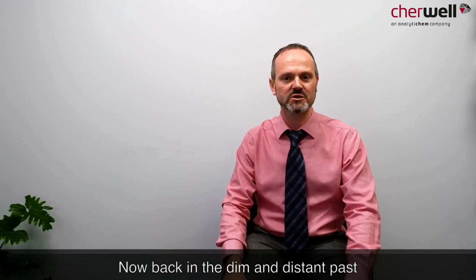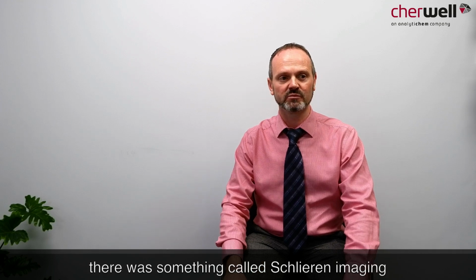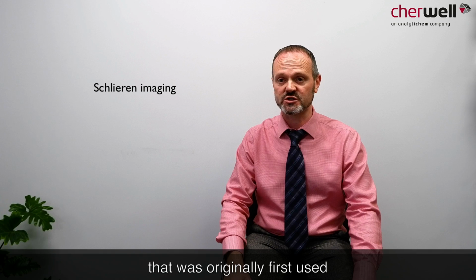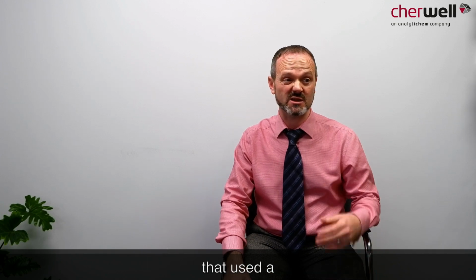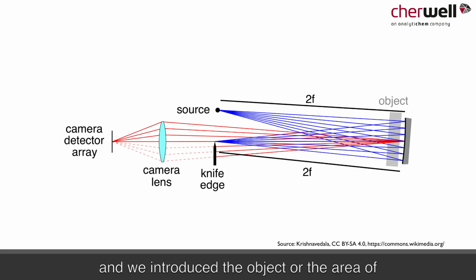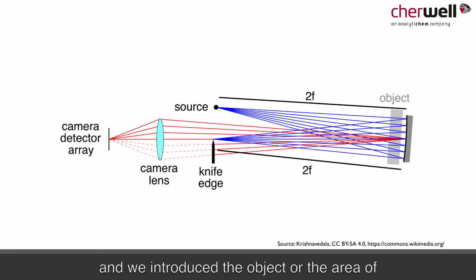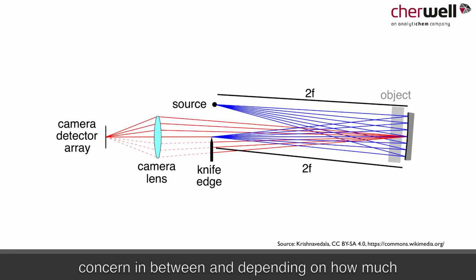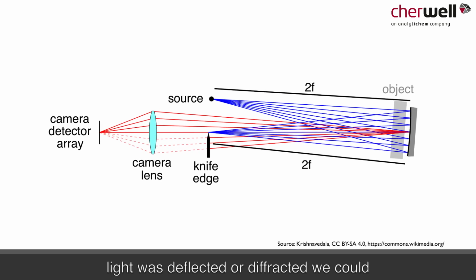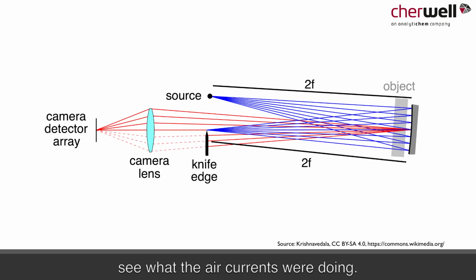Now, back in the dim and distant past, there was something called Schlieren imaging that was originally first used. That used a fixed light source and a mirror, and we introduced the object or the area of concern in between, and depending on how much light was deflected or diffracted, we could see what the air currents were doing.